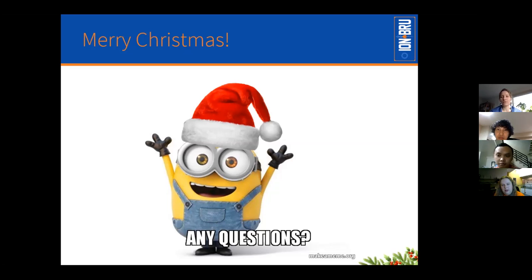Have you seen there's actually a kit now in the Nanopore store for it, where if you have a region of interest up to 20 kb in size, you can use Cas9 to cut either end, and then the library prep will only work on those cut bits. So basically you dephosphorylate your DNA, so there's nowhere for the adapter to ligate to except for those cut regions.